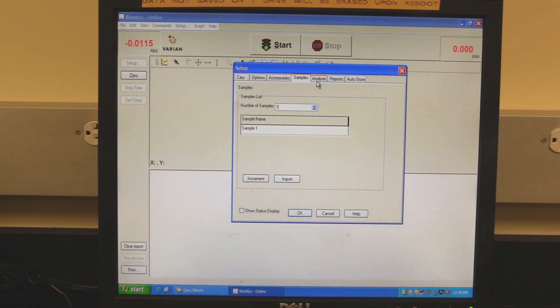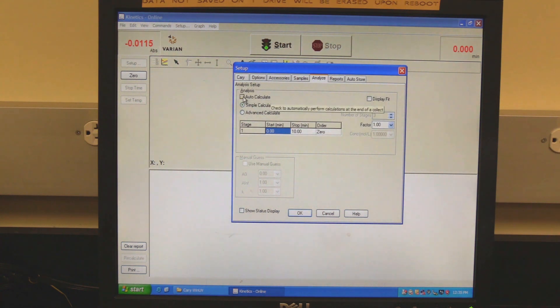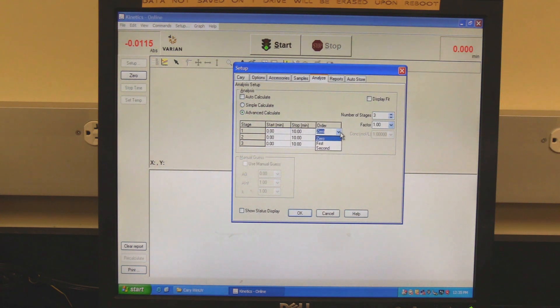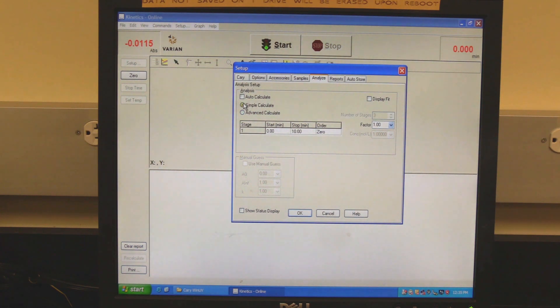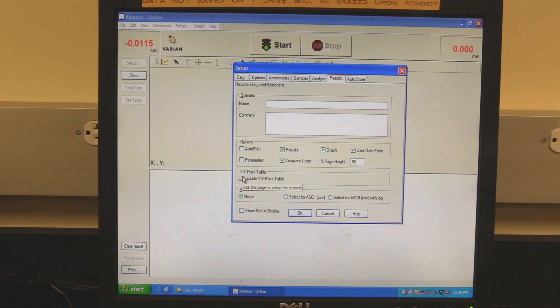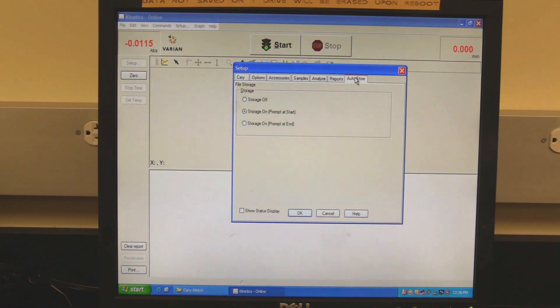Click on the analyze tab. Check the auto calculate box so the software will automatically calculate at the end of the measurement. Select simple or advanced calculate — simple if there is only one stage, advanced if there are multiple stages. Set the order to zero, first, or second. Set the required factor. Click on the reports tab. In XY pairs, check the include XY pairs table box to include a table of XY values in the report. Click on the auto store tab, select when the software should prompt for the data to be saved. Click OK to set the setup parameters.